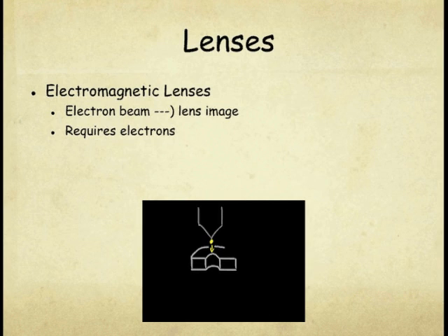Secondly, thicker glass lenses have larger magnification factors due to refractive indices and the ways that light bends as it travels between two substances of different density. Electrons, however, do not travel so easily through materials, so electromagnetic lenses are hollow in the center. There are in fact stationary lenses whose strength can be varied by altering the amount of current that runs through them. This works because an electric current through a coiled conductor creates a magnetic field in its center. The strength of this field serves to reshape the electron beam.